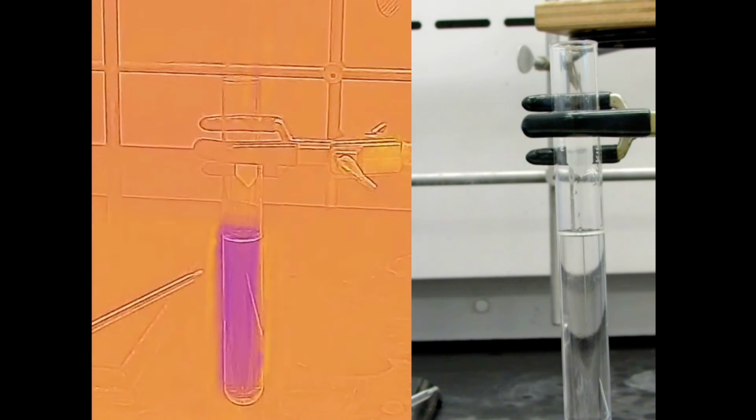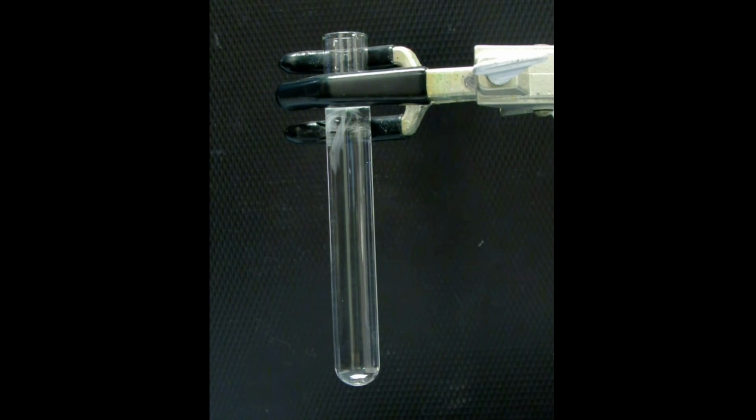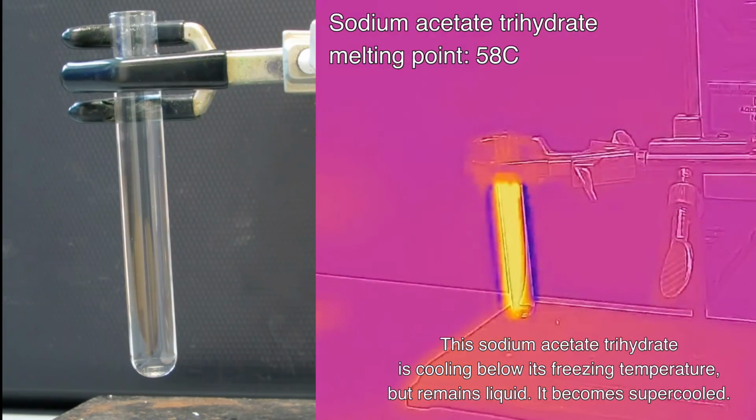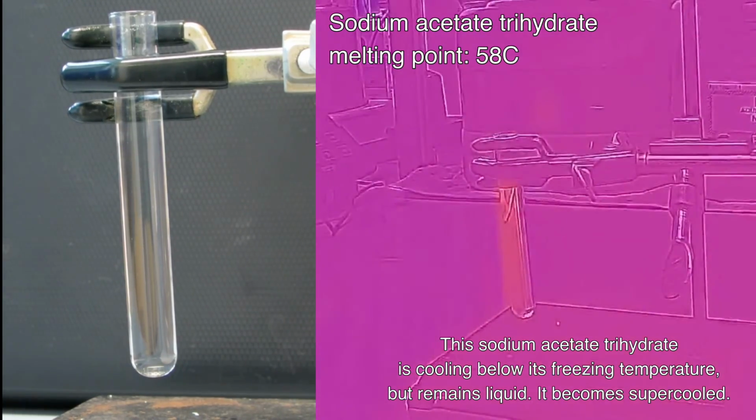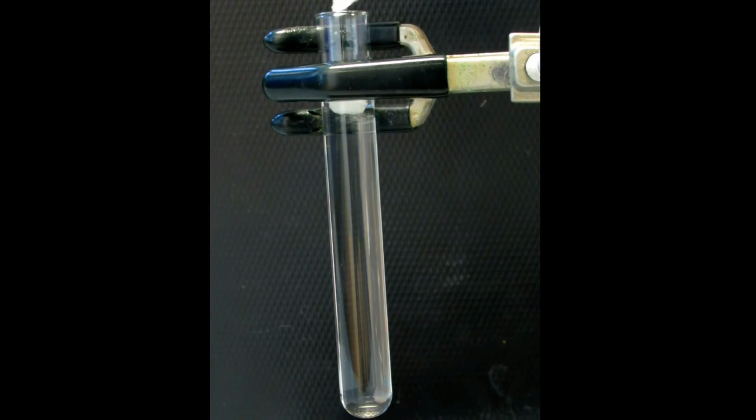Next, let's see some exothermic reactions. One fun reaction is when supercooled sodium acetate trihydrate crystallizes. Supercooled liquids are formed when a liquid is cooled below its solidification temperature without freezing. This occurs when there are no nucleation sites for the liquid to begin crystallizing. When a small crystal of sodium acetate trihydrate is added, it provides a nucleation site to initiate crystallization.